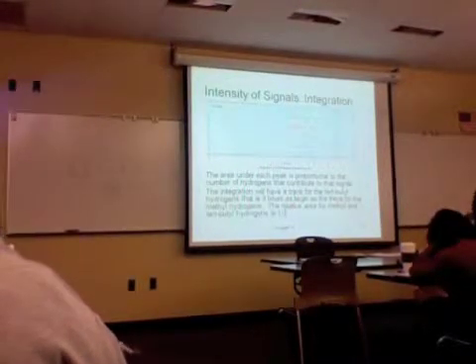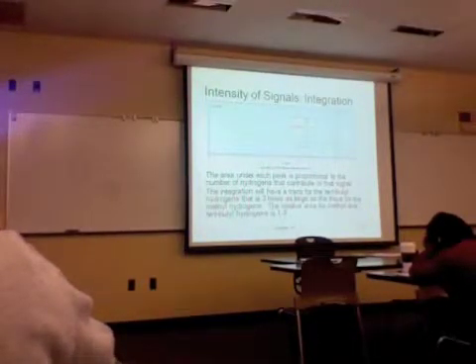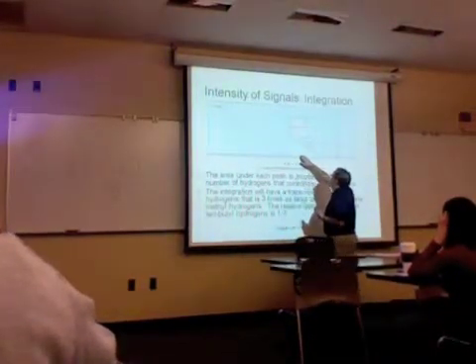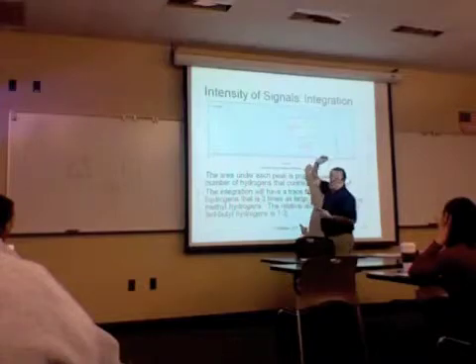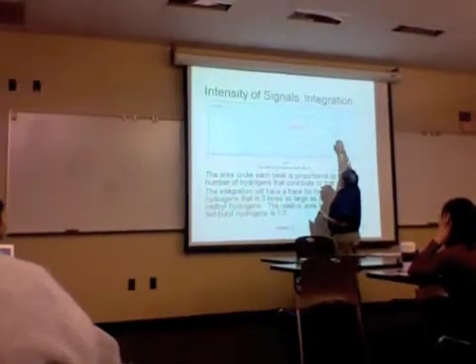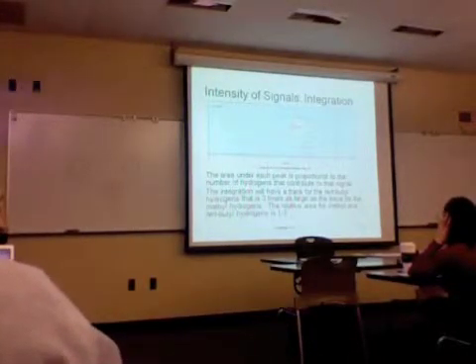The intensity of the signal, again, reflects the number of hydrogens represented by the signal. In the case of a molecule much like what we were looking at before, we've got 9 here and 3 here. Older instruments used to integrate the signal like this. There would be a drifting line here, and as soon as this starts to go up, it's counting the area. This jump is proportional to the area under the peak. It's an integrator. We see about 2 units here, and a jump of 6 units here, and that's a 3-to-1 ratio, which is proportional to the difference in the number of hydrogens in the signal. You don't see this kind of integration as much anymore.